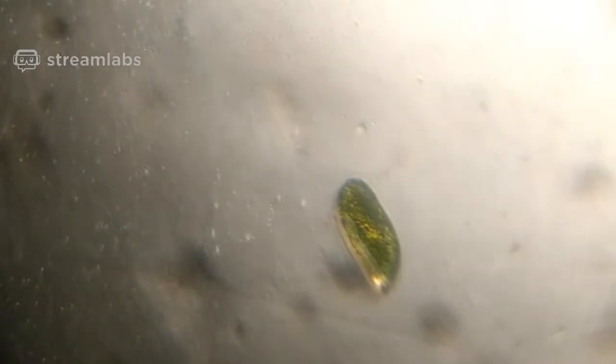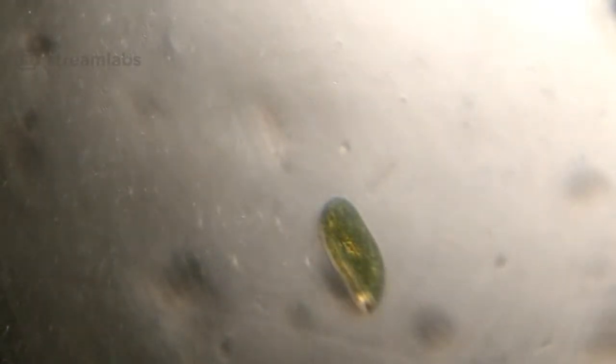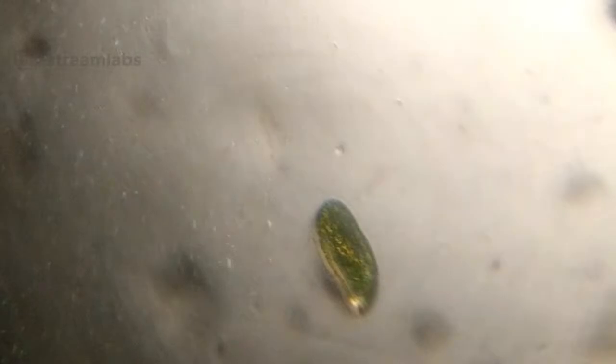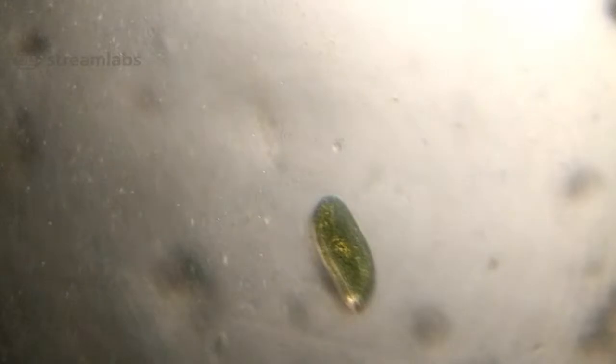It has eaten a bunch of plants called chlorophytes. And it doesn't need to look around for food. All it needs is to use the photosynthetic product of the alga that it has swallowed, and in return it protects it. So here you have two ciliates of the same genus.